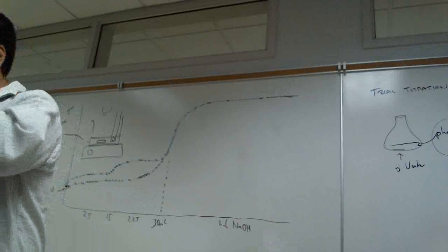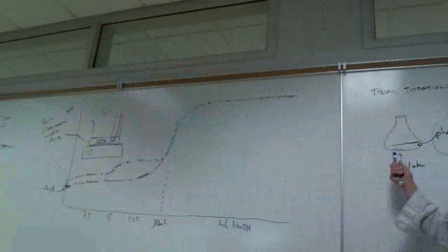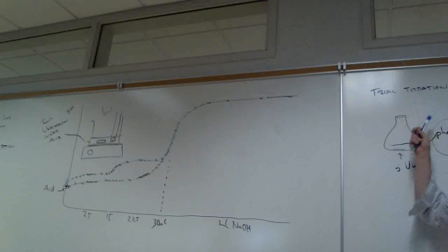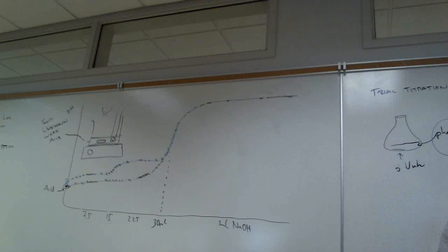All right, it depends on how much confidence. Some people, when they do the trial titration, use a very small amount. I've seen trial titrations like this, and it only takes like a milliliter to hit the endpoint. 1 milliliter is how many drops? Roughly 20 drops. It's not accurate, so don't use that, but 1 milliliter is about 20 drops, roughly.